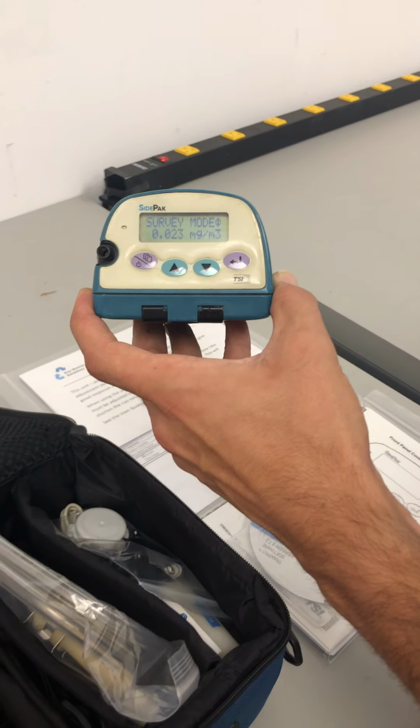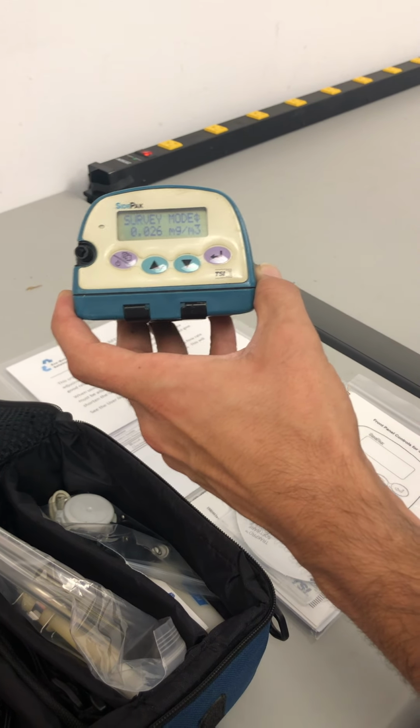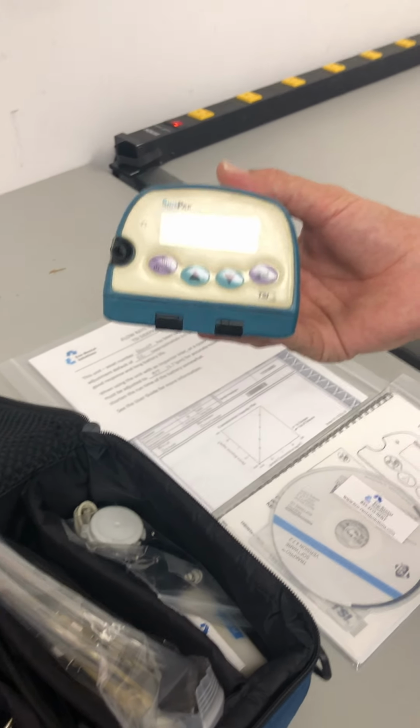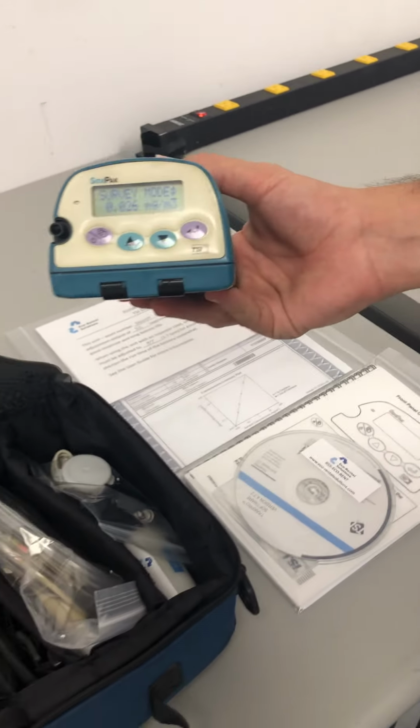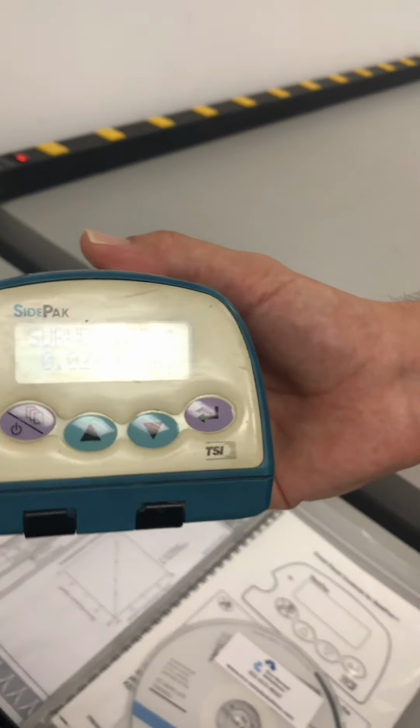Oh, you're right. We've already zeroed it for you, so you shouldn't have to worry about that. We're actually surveying right now. Okay. So it says survey mode, it doesn't say warm up mode. Right. Yes. So we'll just take that reading right there.